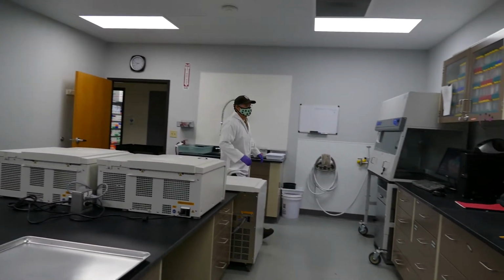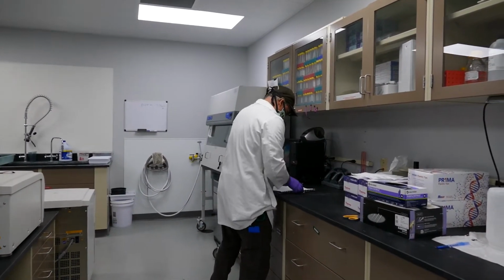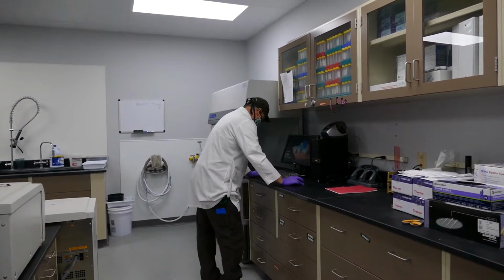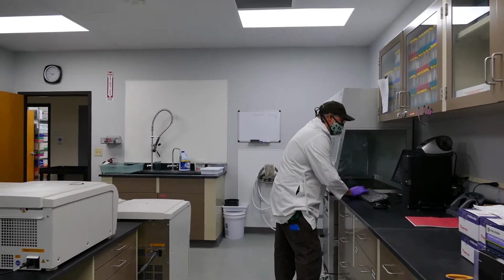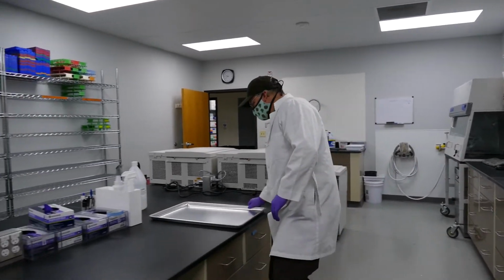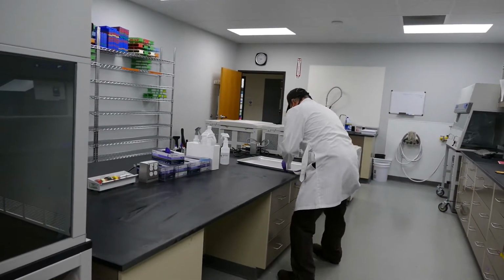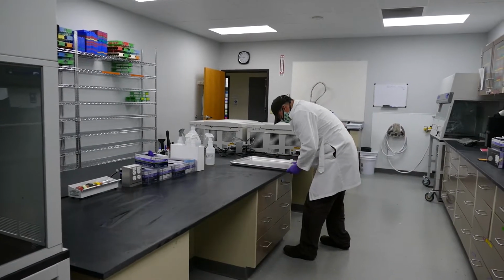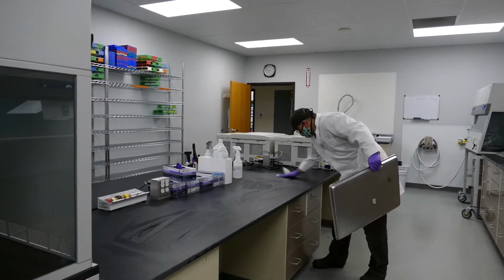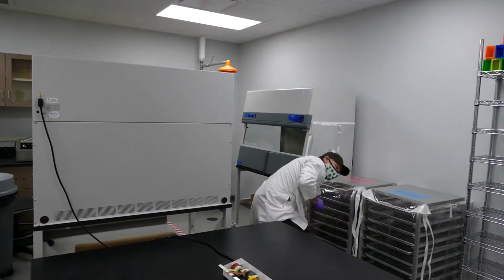From there, return to the lab area and fill out the benchtop logbook. Then proceed to the computer and update the case log. You can then clean up the workbench and tray with DNA Away. Put the tray back on its rack and turn off the UV light on the hood.